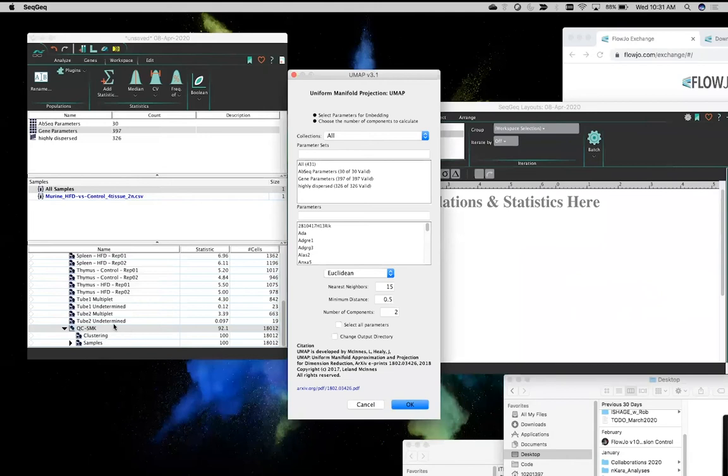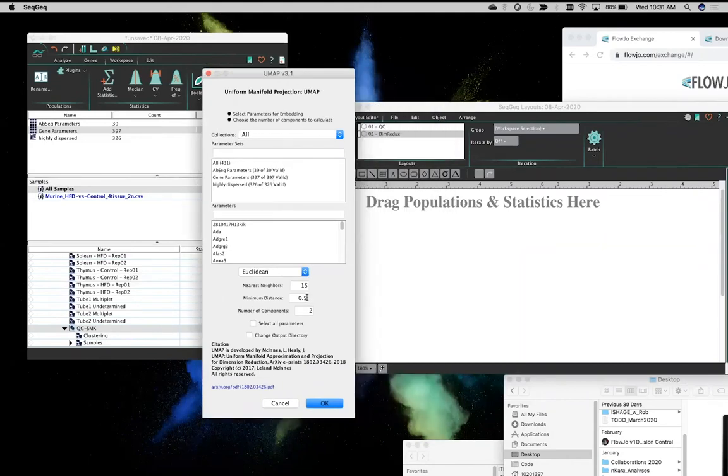Right now, my new kind of shiny pebble is the UMAP algorithm. So UMAP's just done a new release, and we've just done a new release of the plugin as well. In the newest release of the UMAP plugin, you can actually generate more principal components, or not principal components, UMAP components, I should say.